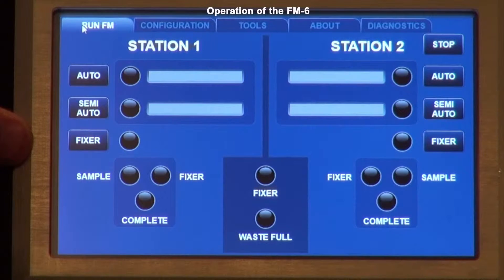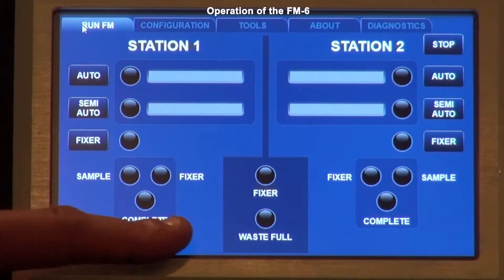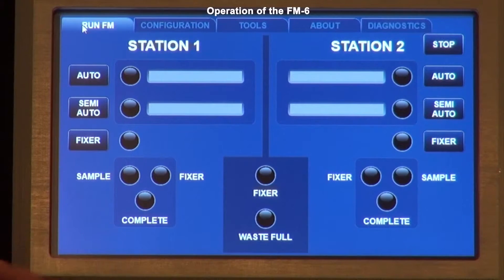The fixer button simply dispenses the fixer as you hold it, so if a slide has oil on it you can run the fixer briefly to wash some of the oil off. After pressing the fixer button, the waste pump will run for about 30 seconds and then shut off. At each station you have a sample light, a fixer light, and a complete light. The sample light turns green if a sample is placed in the sensor, and black if the sample is out.